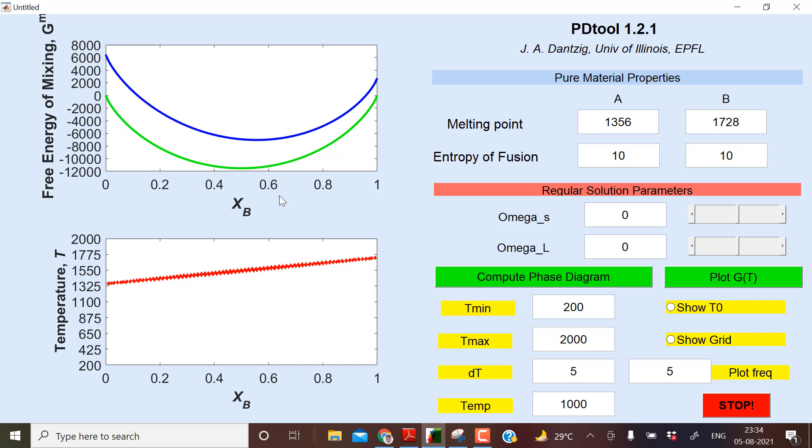Now, okay, now going to draw the phase diagram. So this is the free energy of mixing at temperature of 1000K.